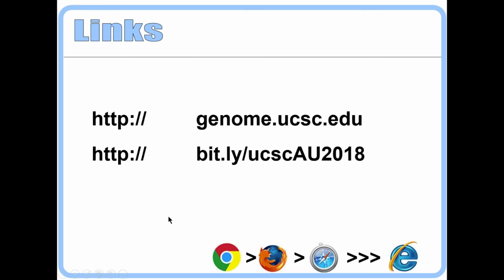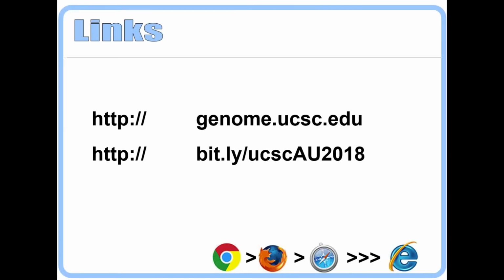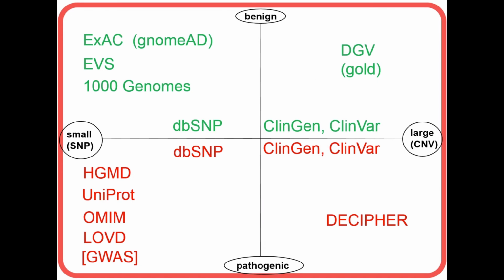So here are links. Yesterday, I gave you the wrong link on this slide. The second slide will be a link to a page. Please open up a browser window or a tab to that page, and we'll be accessing that content forthwith. This slide is also on that same page, that index page you get to when you follow the bit.ly link right there, and that's just to give you a little outline of what we hope to accomplish today.